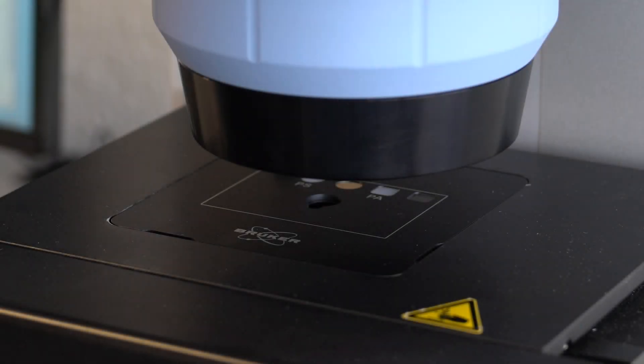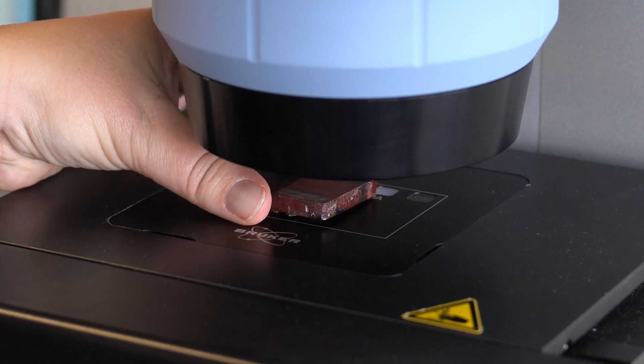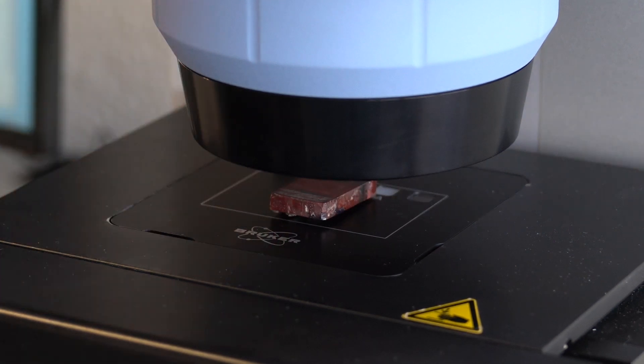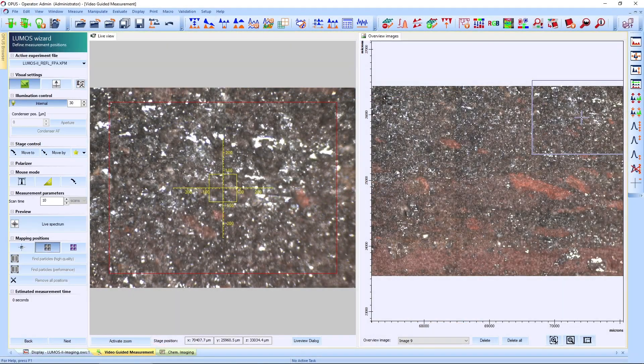Let me demonstrate this with a piece of South African BIF. We simply take the rock section, place it under the Lumos II FTIR microscope, and in less than two minutes, we can start the analysis.